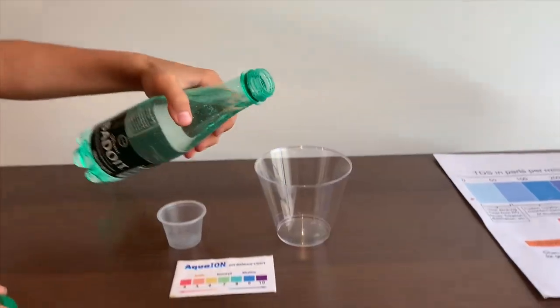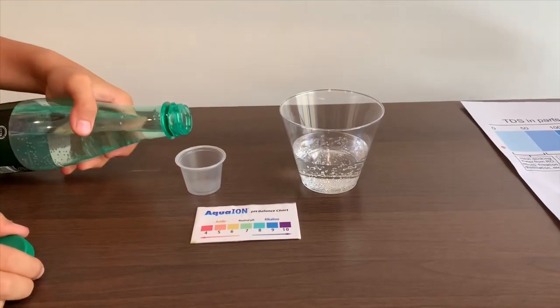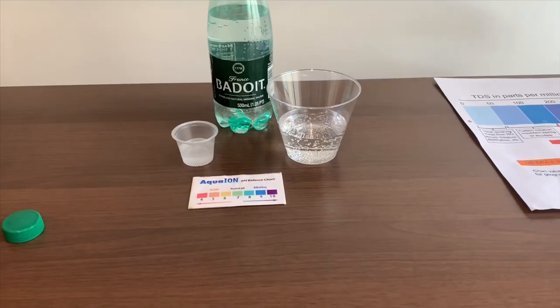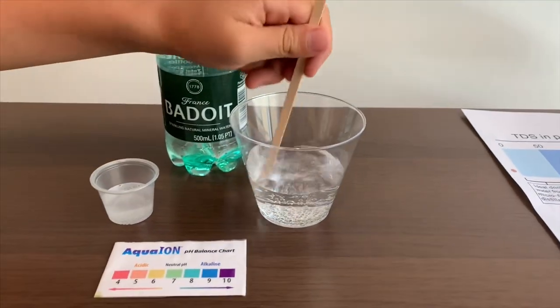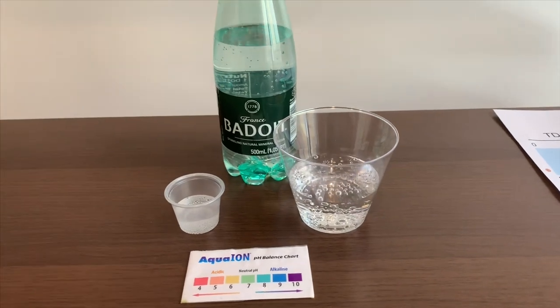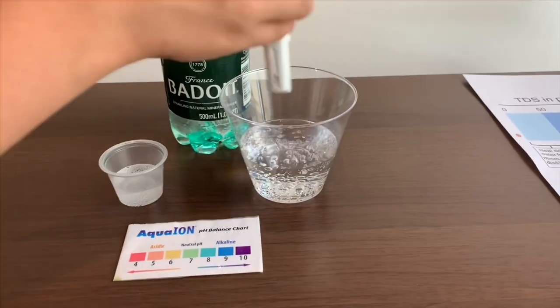Let's pour some water in. First, let's test the TDS level. If you want to buy this TDS Tester, check the link down below. Let's stir it so we'll get a better result. Turn on the TDS Tester, make sure it says 0, and put it in.